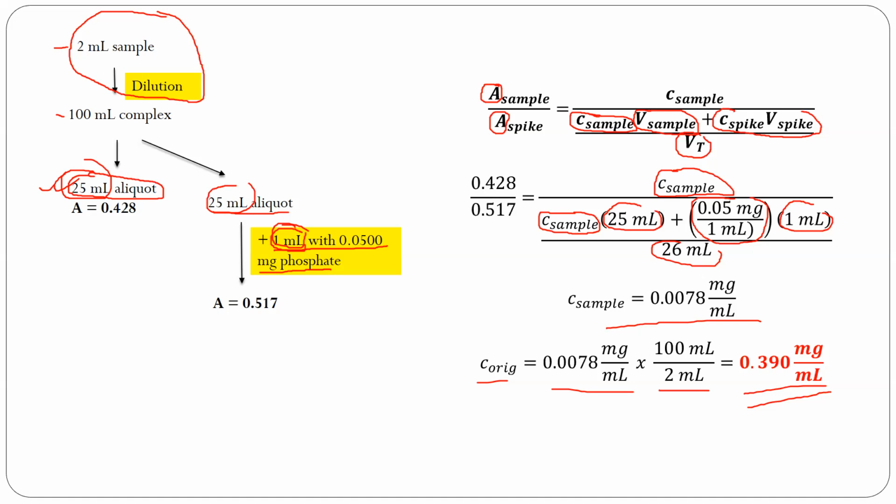Or we can use the standard addition method. And usually, for quick determination, we use the single point standard addition. Just remember this formula. And also, please be careful na kung ano yung sagot na ma-obtain mo from the formula, hindi yun basta-basta yung sagot. Remember what happened during the process. So if there's a dilution, then you have to multiply by the dilution factor.